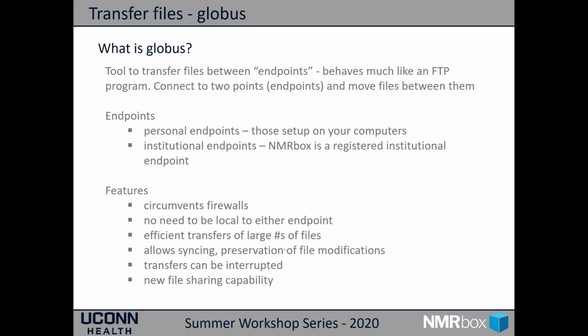But it has some differences. One of the nice features is it can circumvent firewalls. The other thing is you don't need to be local to either of the two endpoints, so it's all done through a web interface. If you have your various endpoints set up, from any web page, when you authenticate, you can see all of your endpoints, even if you're not on those computers.